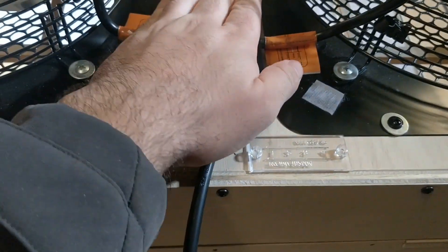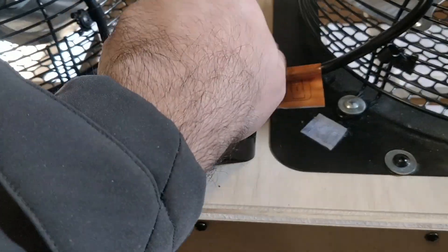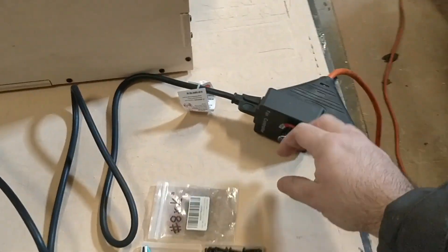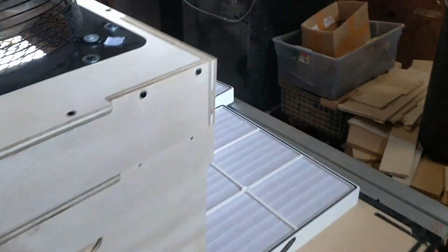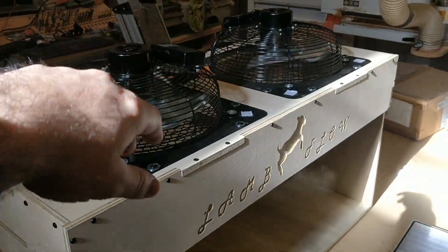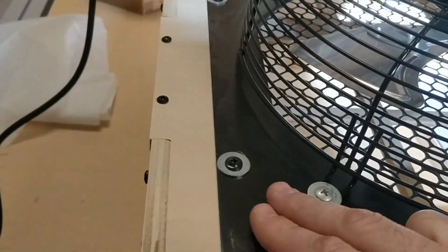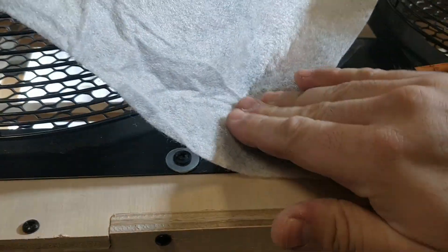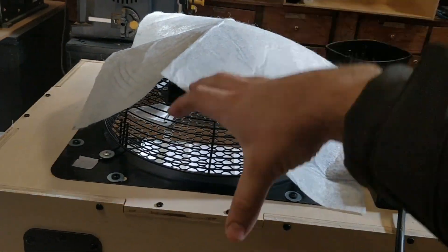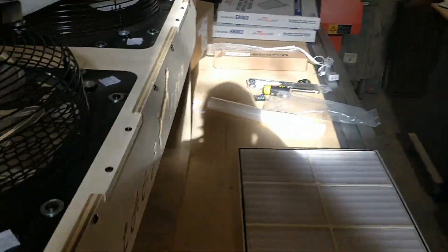Go ahead and install your covers, hook it up to power, give it a little test — it works great. For the intake filters, put the Velcro tabs down right on the corners, grab your filter, place it over top, and press it on all four corners. It'll filter out the big particulates as air is forced through and prolong the life of your HEPA filter.